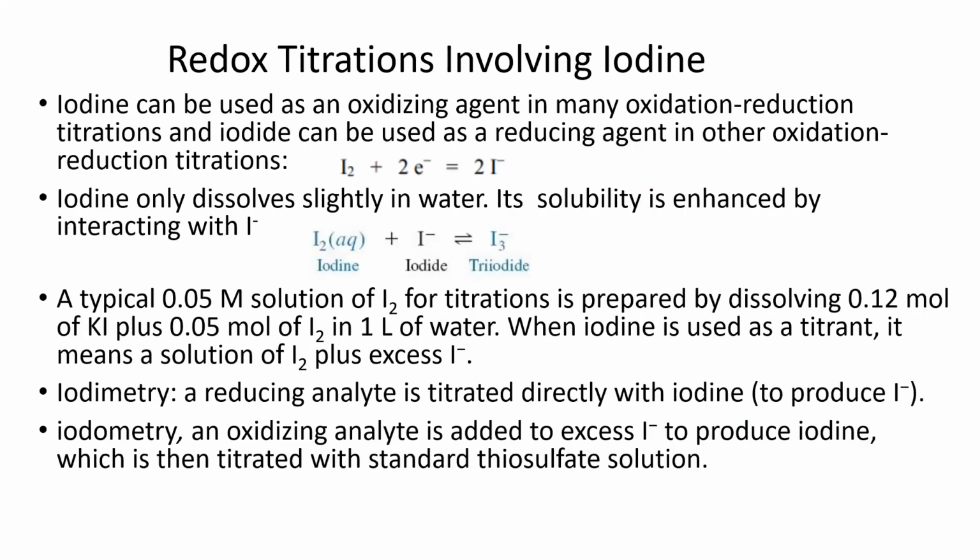So iodine can be used as an oxidizing agent in the reaction.